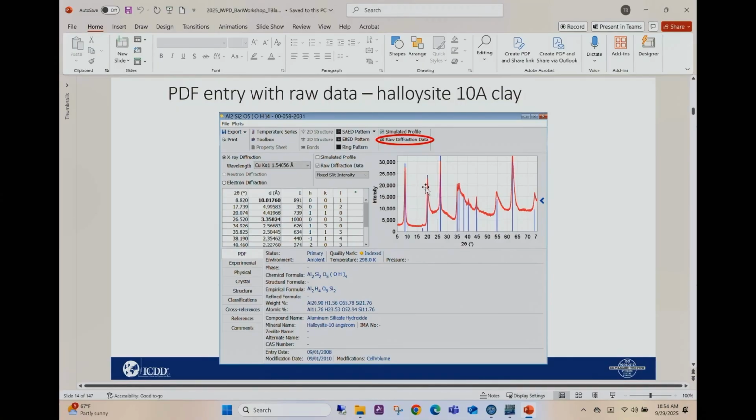Now we know diffraction peaks in a Bragg-Brentano instrument tend to have some asymmetry on the low angle side. You've got this axial divergence issue, but this is a structural thing going on here, and a lot of it has to do with, in clay, some of the misalignment of the clay layer, okay? And there's some disorder, and so you get this asymmetric profile. If you were searching on just a DI list, you would never get that profile information.